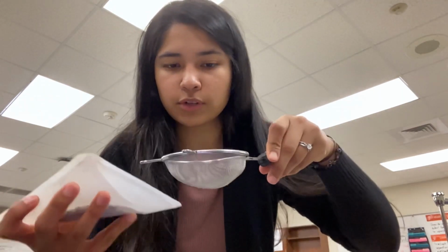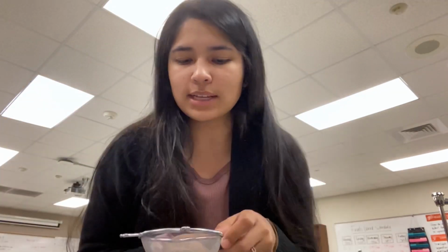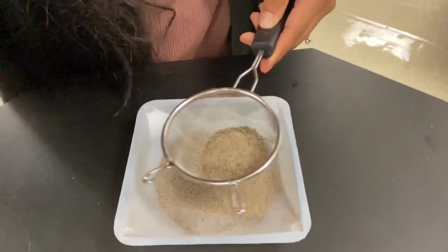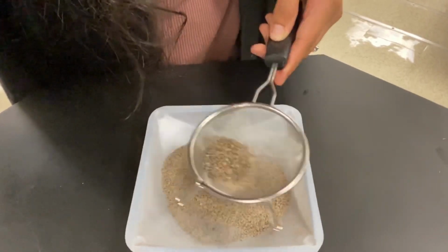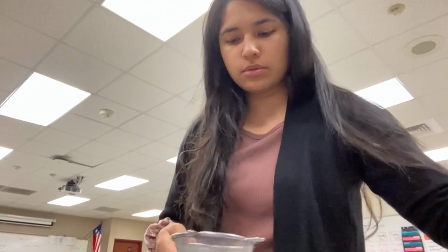So the sifter goes in here, and I'm just trying to separate them by size. So basically that is what's happening. All right, so our pebbles are all out.